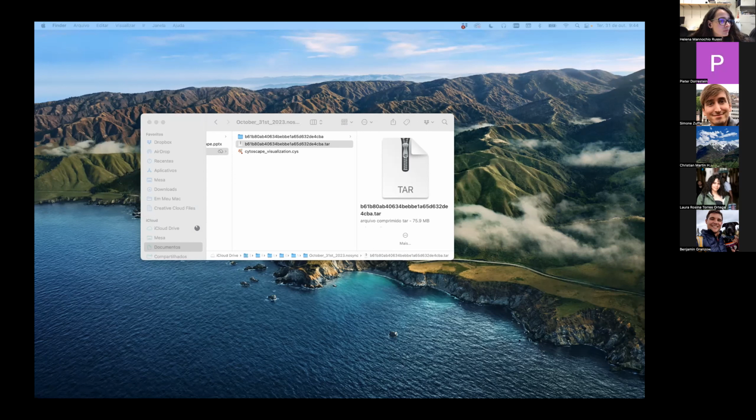Shipay or Felipe, could you link the decompressed folders for people so that they can follow along in the next steps? Because if it's an issue with their unzippers, essentially decompressing the files may not be up to date. Could be. Megan said, yes, Mac doesn't have a default for uncompressing tar files.